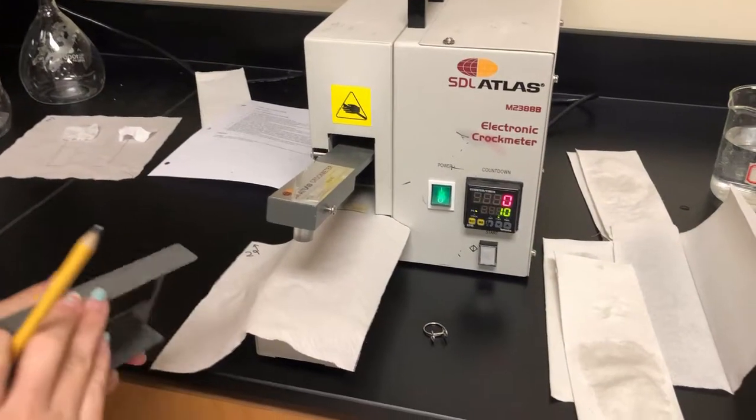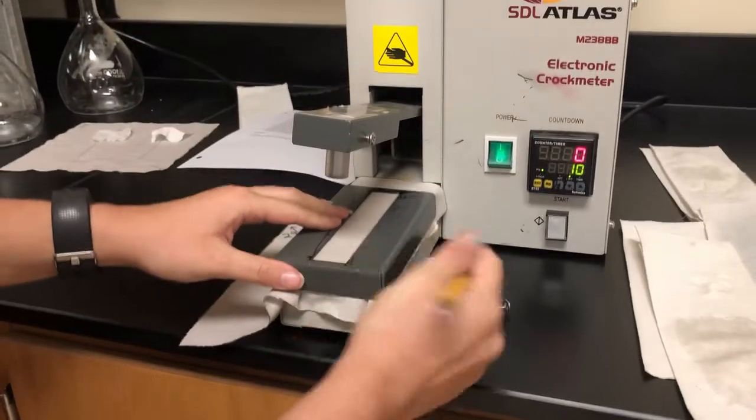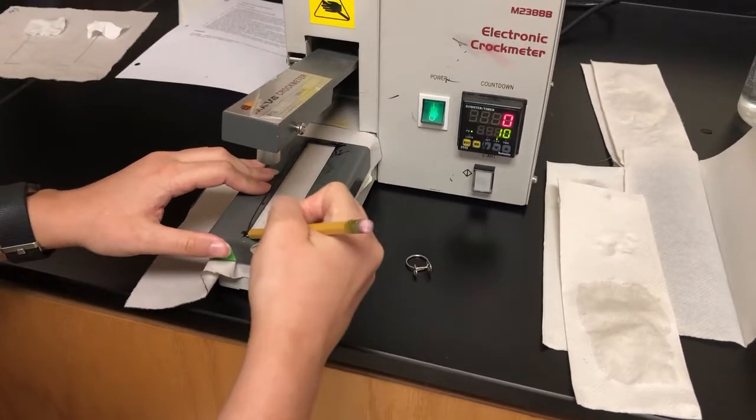Step 2. Place one of your specimens on the crock meter in a way that the specimen will be rubbed in the bias direction when the machine is on. Mark the exposed area with pencil for later comparison.